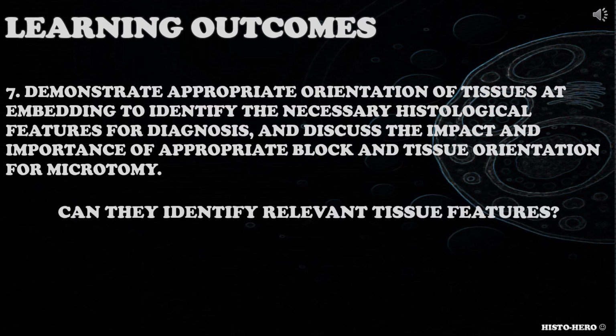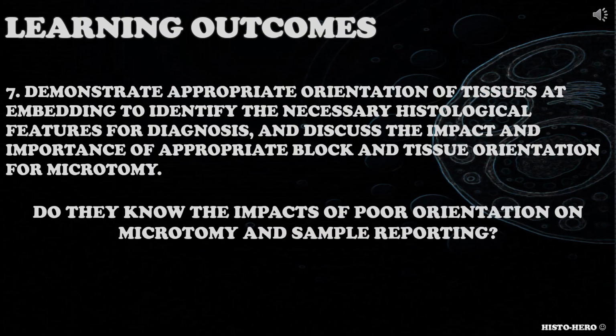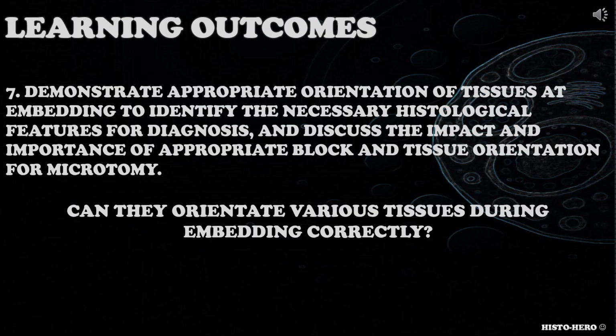Can they identify relevant tissue features? Do they know the impacts of poor orientation on microtomy and sample reporting? Can they orientate various tissues during embedding correctly?